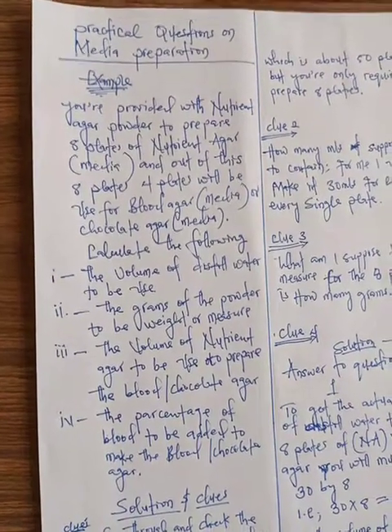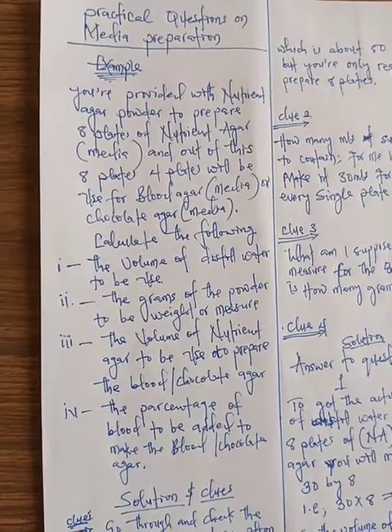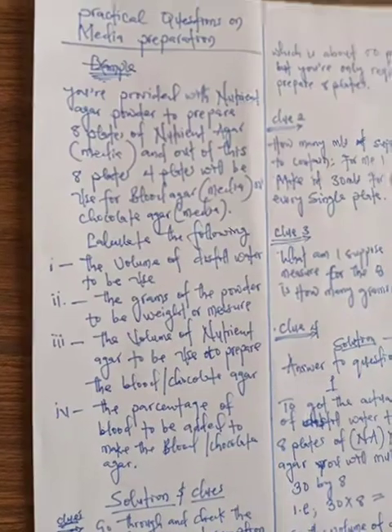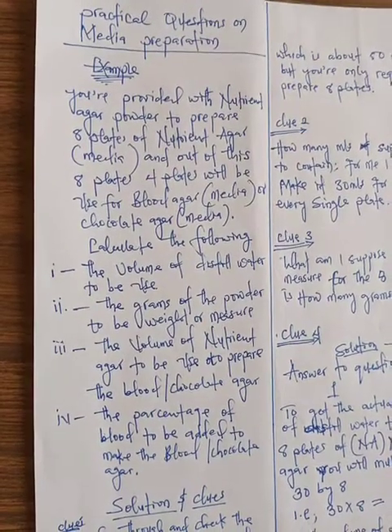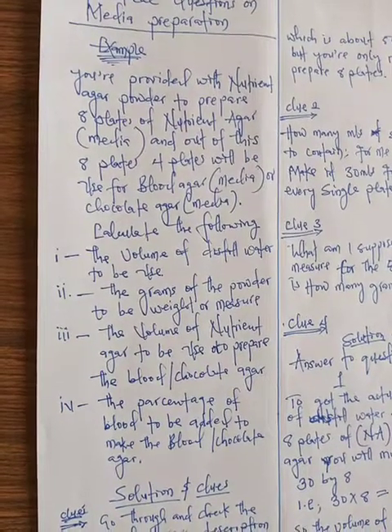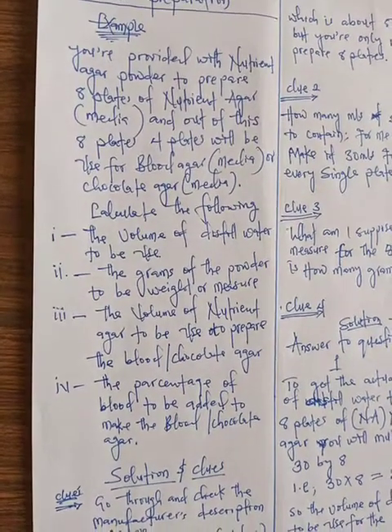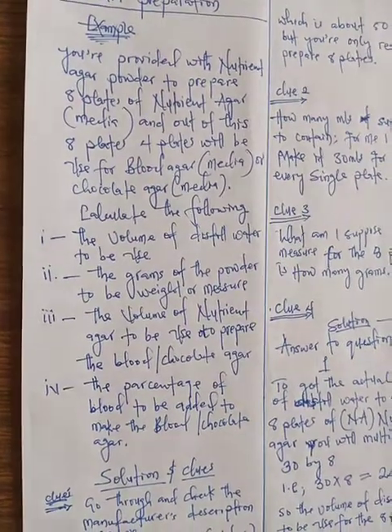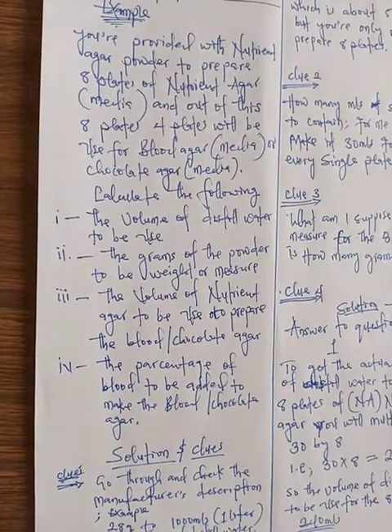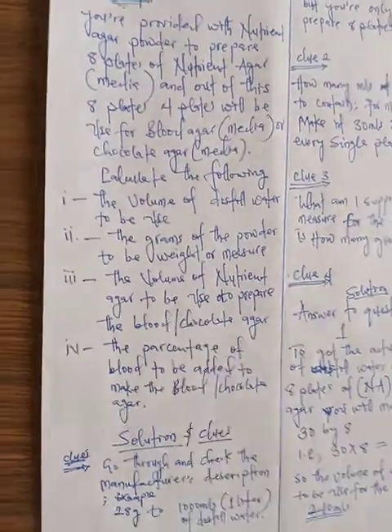And out of these 8, 4 plates will be used for blood agar or chocolate agar. So the question says calculate the following: the volume of distilled water to be used, the grams of the powder to be weighed or measured, the volume of nutrient agar to be used to prepare the blood or chocolate agar. The last question, which is number 4, is the percentage of blood to be added to make the blood or chocolate agar.